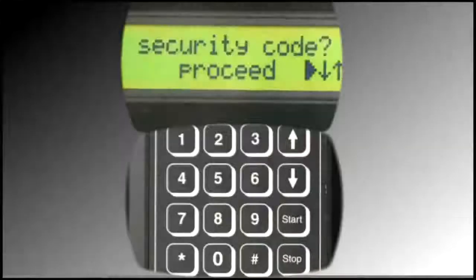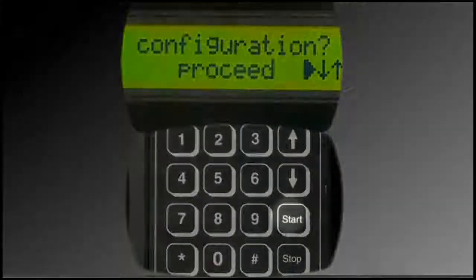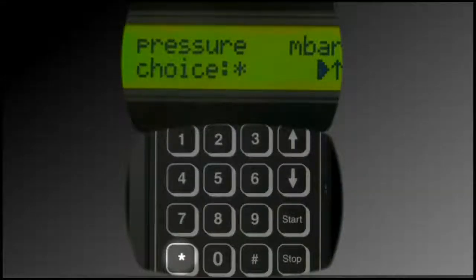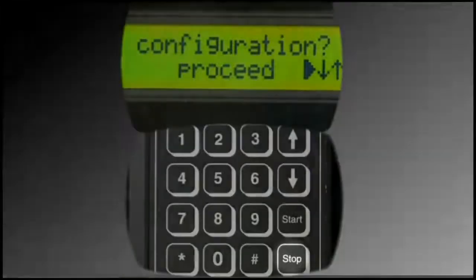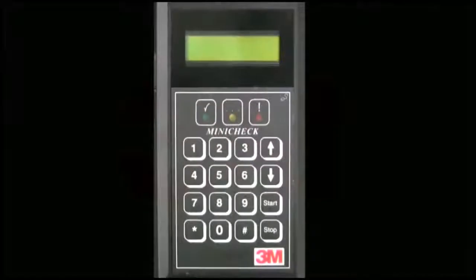Press the up arrow five times. Configuration displays. Press the Start button. Pressure displays. Press the star button to toggle between desired units of pressure: PSI or millibar. Press the Stop button twice — this returns you to the Service Menu Start screen. Guidance on Service Menu parameters not covered in this video can be obtained by contacting 3M Purification Technical Support. In addition, the Troubleshooting video segment addresses performance-related parameters that can be set in the Service Menu.